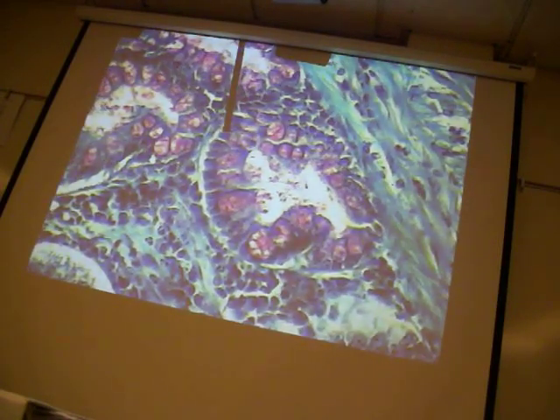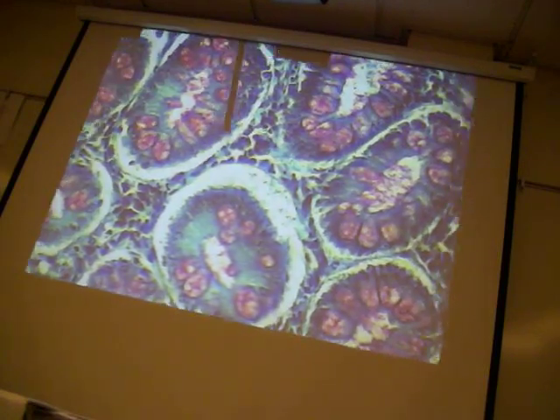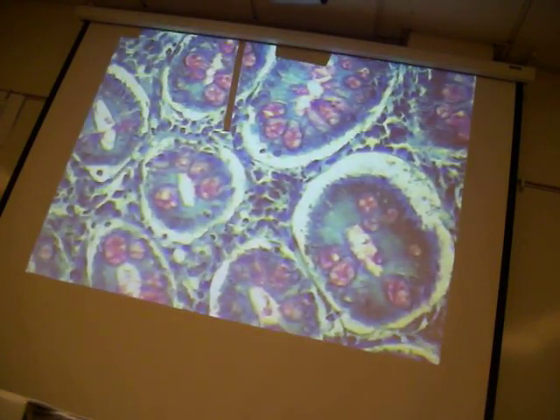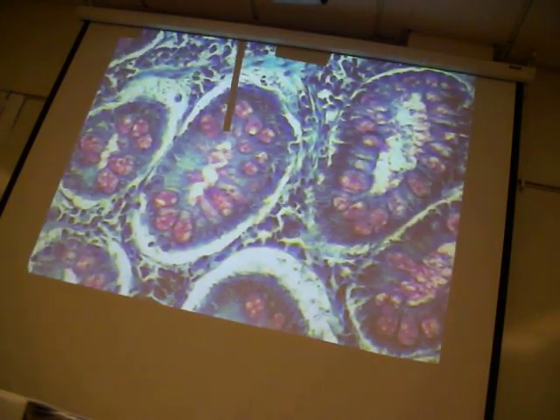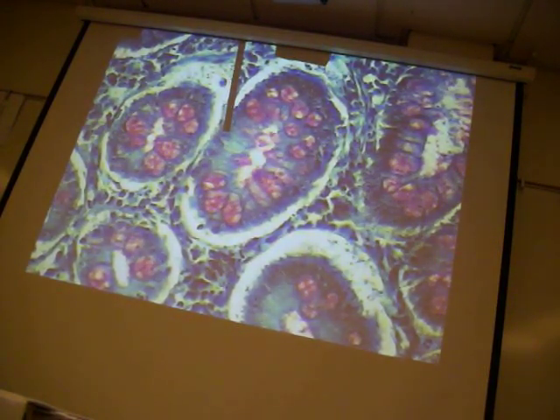All right, here are these cells. This will work. These guys will work right here. See these? Here's a group of cells right here. The nuclei are these structures right here that the pointer is pointing to. The nucleus in columnar cells are always oriented towards the basement membrane.